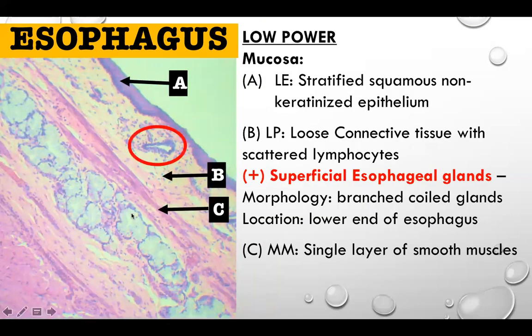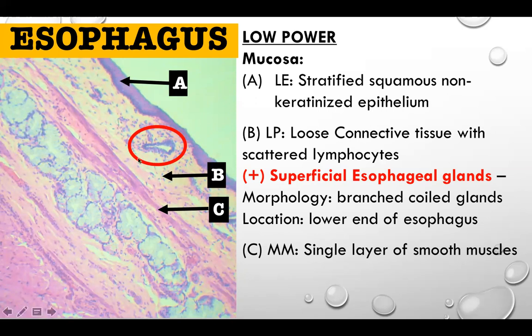Letter A is the lining epithelium — it is stratified squamous non-keratinized epithelium. Letter B is the lamina propria, composed of loose connective tissue with scattered lymphocytes. In this area you will find the superficial esophageal glands, which are branched coiled glands located at the lower end of the esophagus.